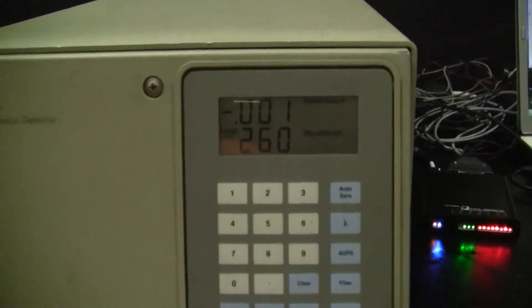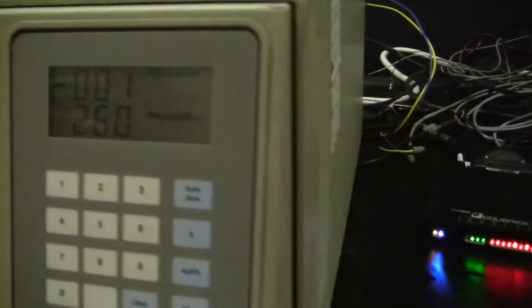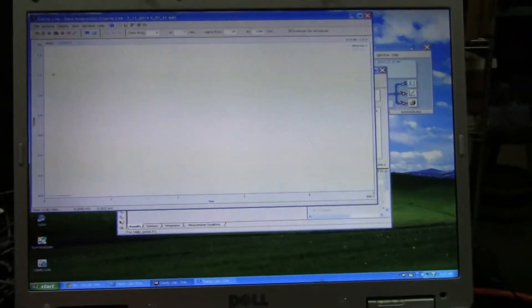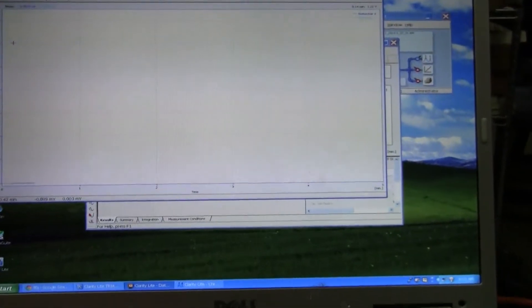We're running a quick sample. We're using the data acquisition system. Clarity Light comes with an A2D box and software.